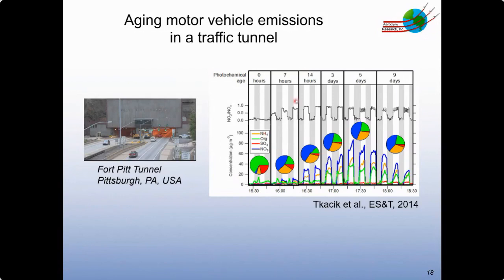During this afternoon rush hour period, we sampled periods ranging from just a dark OFR with no aging to stepping up the lamp settings and going from hours to multiple days of equivalent aging within a few minutes residence time in the OFR. You can see that without aging, when we're close to sources, we have typical primary organic concentrations in the range of maybe 5 to 10 micrograms per cubic meter or so, and significantly less in the way of inorganics.